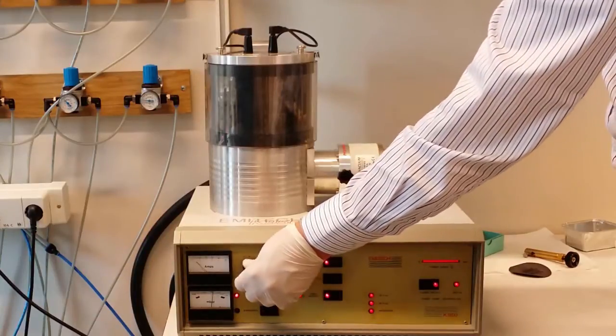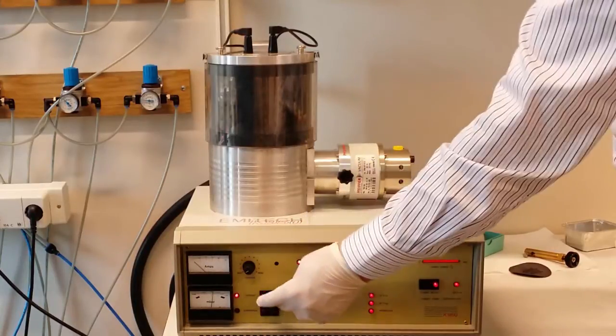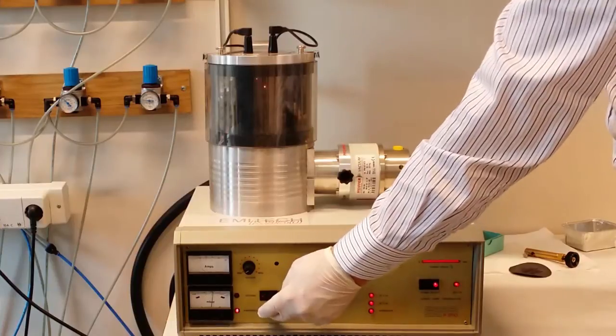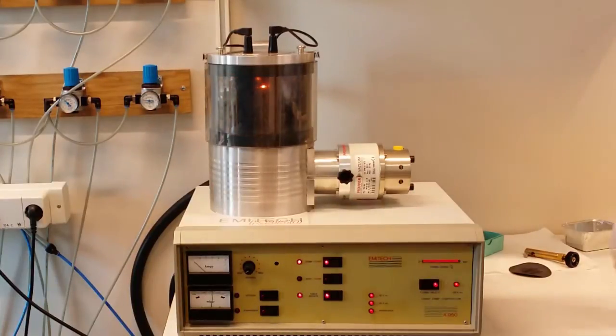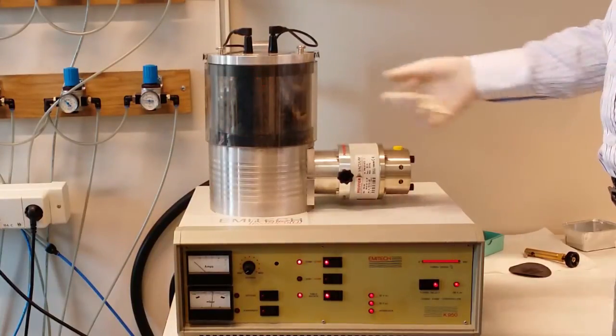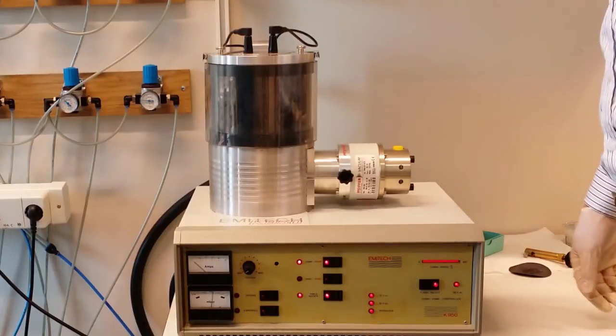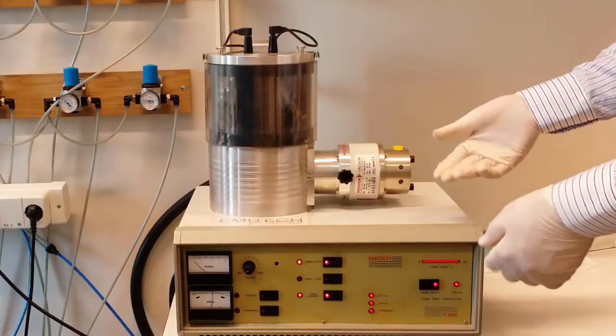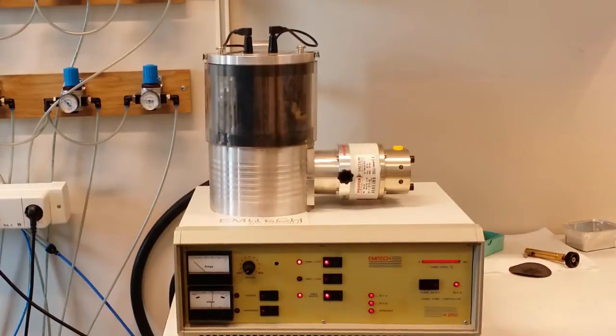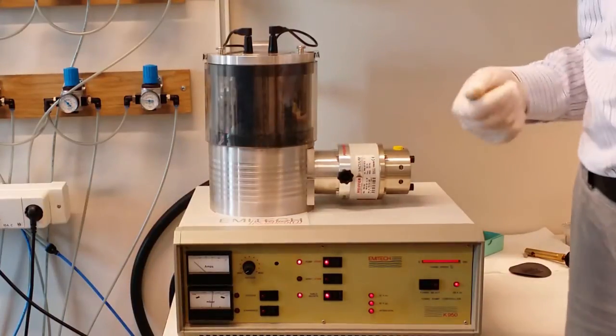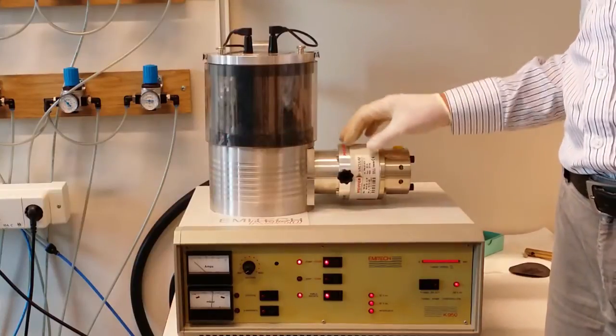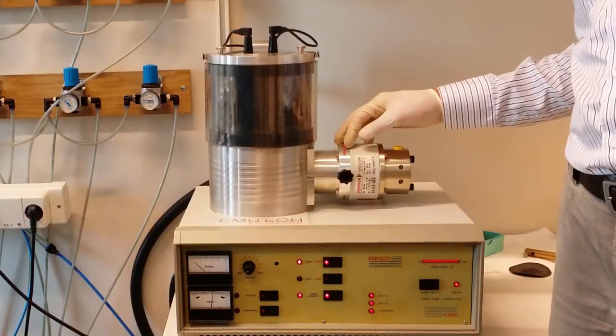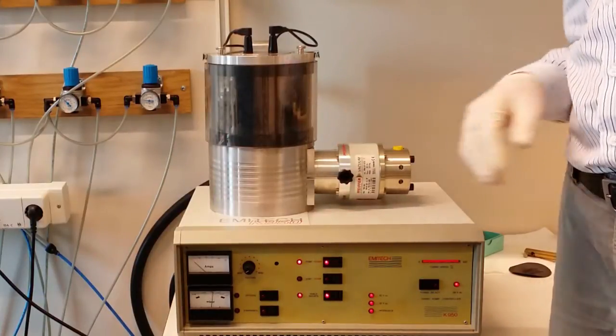I usually do this twice to get a better carbon layer. Outgas. Off. Evaporate. Like so. Now we have evaporated the sample with carbon. So now we are going to shut down the system by turning off the vacuum system. And that will also take a few minutes. That is very important because if you let air inside while this turbo pump is going at full speed it will crash instantly.